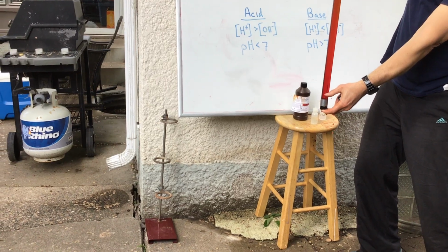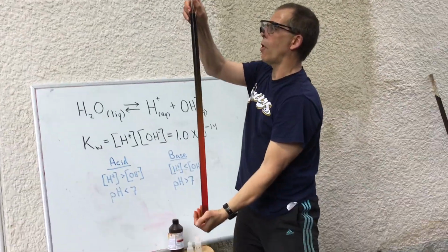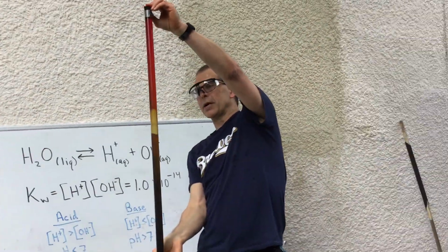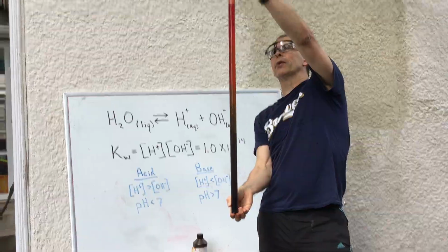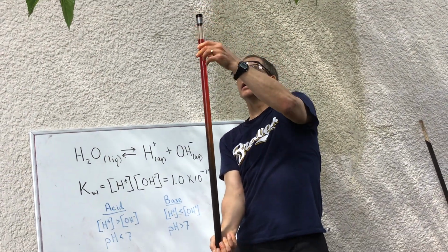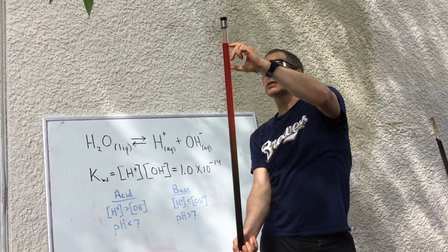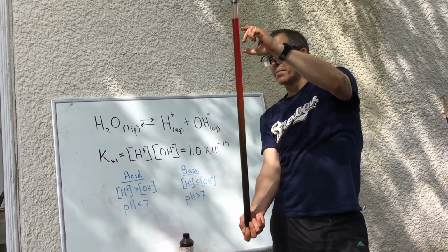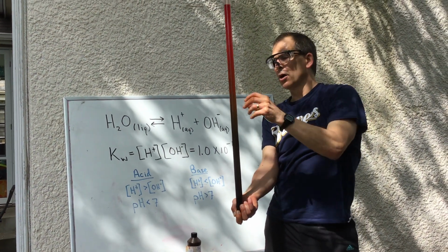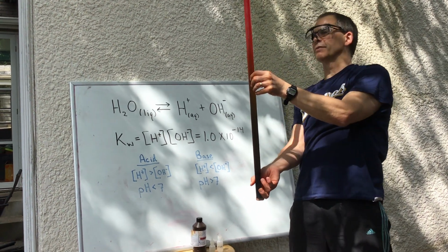I'm finding my rubber stopper, put this in, moving a little bit out of the water out of the leaky end. You can kind of see what's happening. We're starting to mix the acid and base together. But where I added the straight acid right here, it's more acidic. So it's more acidic here where it's red, where it's dark blue, it's more basic. Right about in the middle here, it's going to be a neutral pH. That'll be a pH of 7.